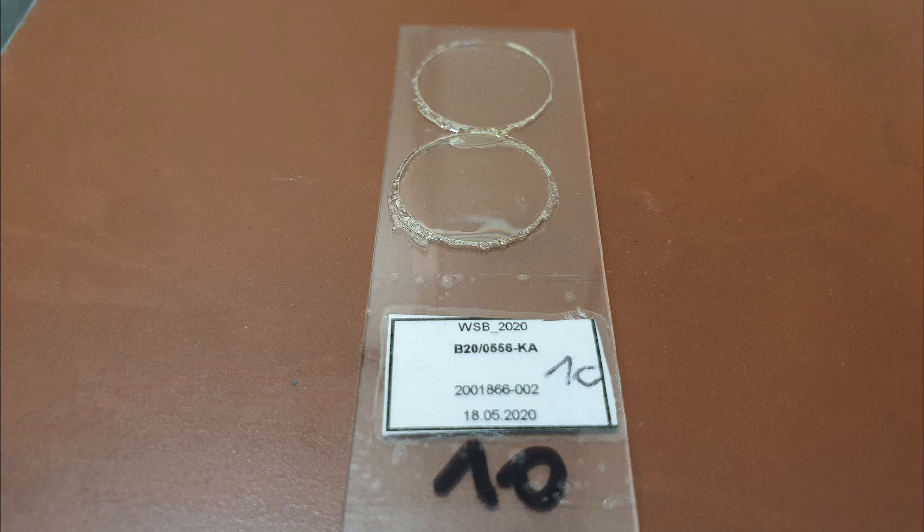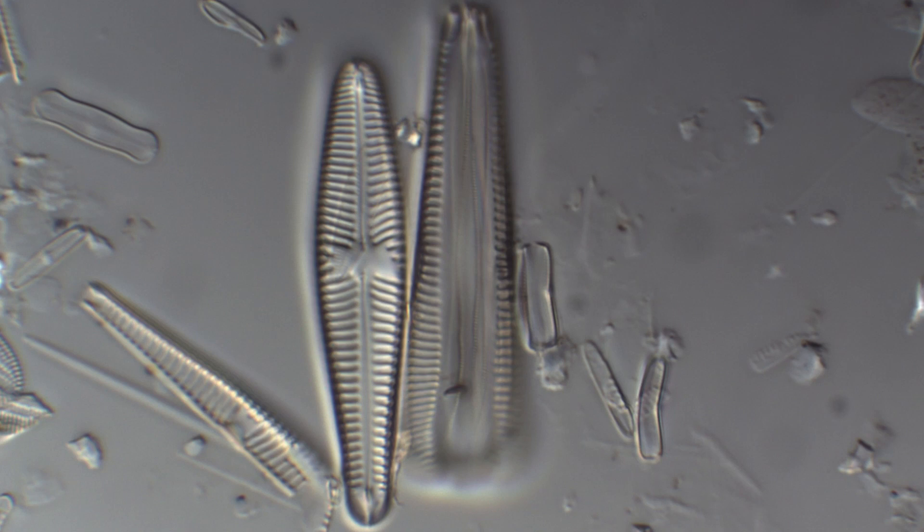Finally, label the slides and check under the microscope. For high quality slides, the diatom valves should be evenly distributed on the cover slip and not significantly clumped. Ideally, there should be 5 to 15 valves, but not less than one per field of view when viewed at 1000x magnification.